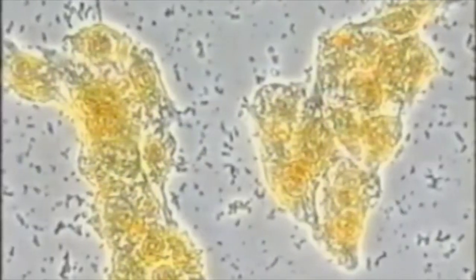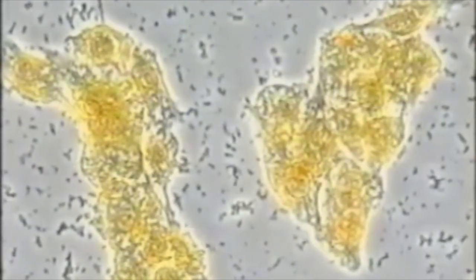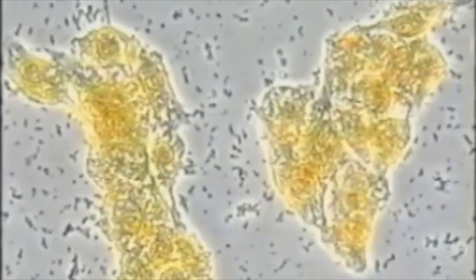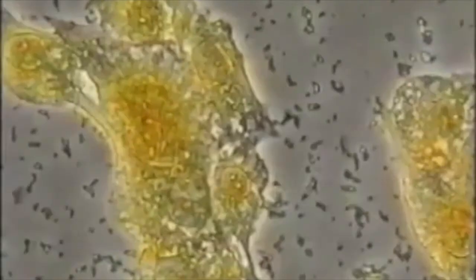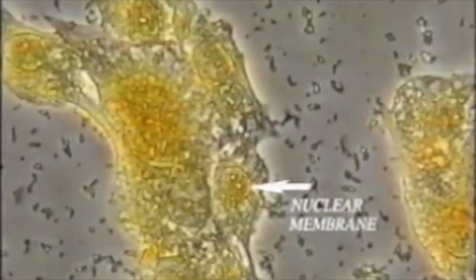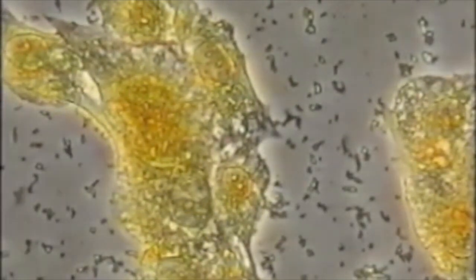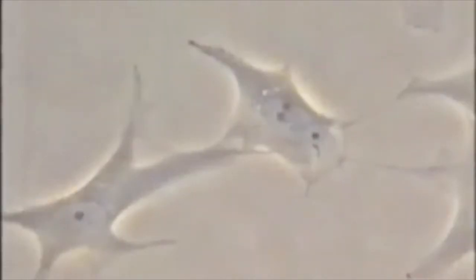Here we see once more glioblastoma cells 19 hours after we started the experiment. The color of PB100, increasingly bright, is now orange, while fluorescence decreases. Glioblastoma cell destruction continues. Cytoplasm falls to pieces. The nuclear membrane becomes yellow. Still, no changes have occurred in normal astrocytes.